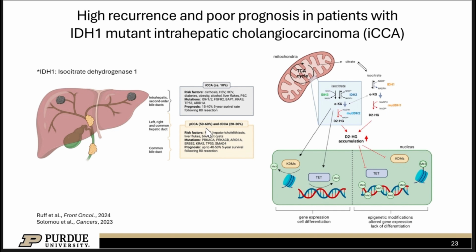There are many studies that have shown proteome changes at the cell level, but we want to see if this cell-level change can also be reflected at the EV level, which means we can use the EV as a potential source for detection of this subtype and also provide treatment monitoring.